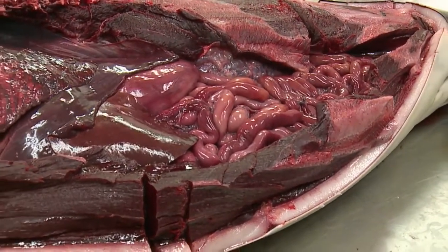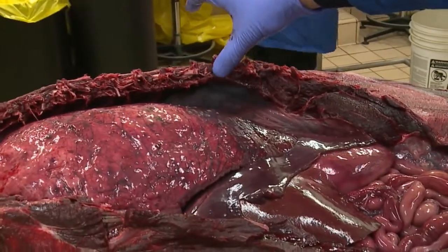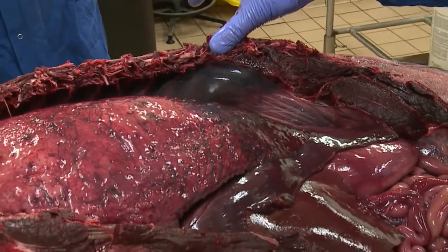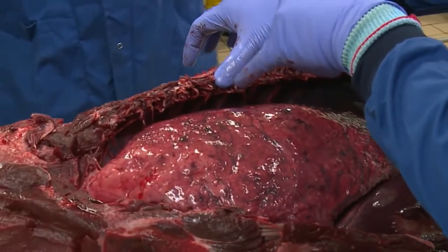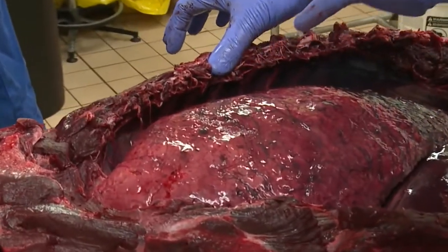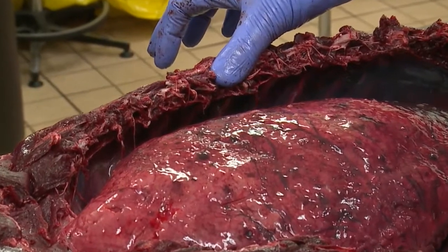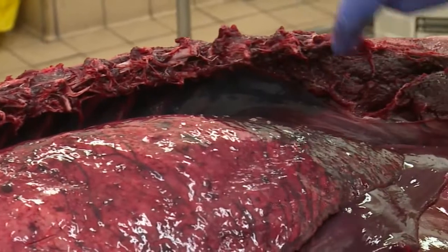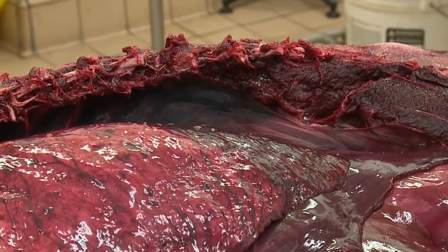A couple of things to point out in relation to bycatch. So just here, in the roof of the back, hopefully the camera can show you this dark area. In the roof of the back, over here is probably more obvious, you can see this network of very fine blood vessels, almost like vermicelli, hopefully that's clear on the camera. These are called retia mirabilia, or wondrous network. Network of blood vessels, but the important point is you've got this area of hemorrhage, that's what this dark area is here, and that's something we quite commonly see in bycatch cases.